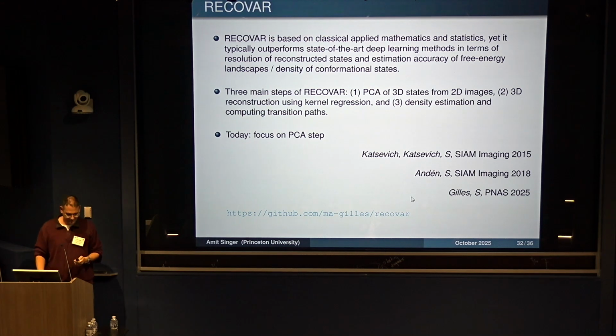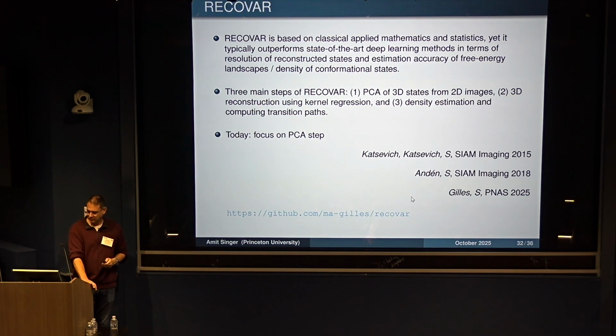Yeah, question? If the states of the molecule are very distinct, rather than a rotation in one dimension, like really breathing, you presumably need to cross the individual instances, individual projections somehow, or the reconstructed volumes.